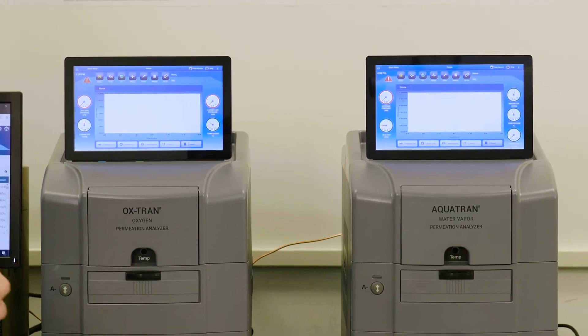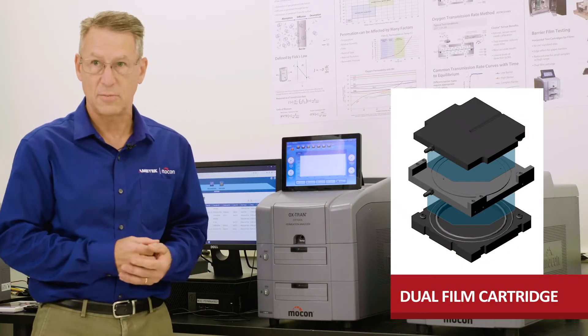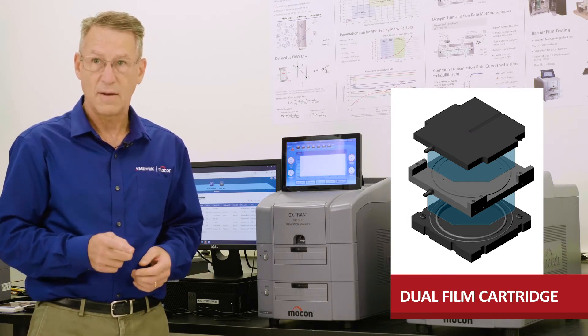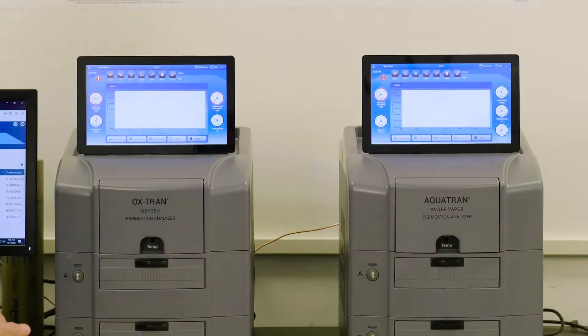To achieve the higher throughput, we've introduced a new dual film cartridge in these instruments that allows them to test four separate film barriers at once. Each instrument holds two cartridges that are standard 50 square centimeter film.